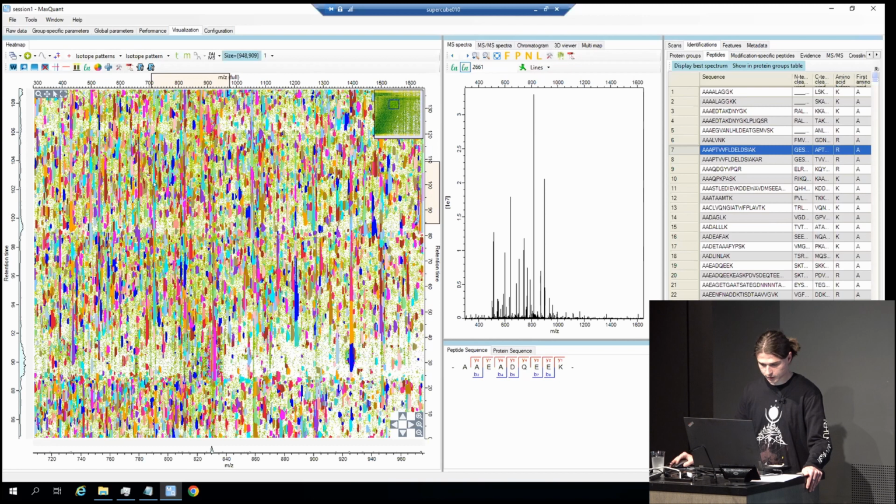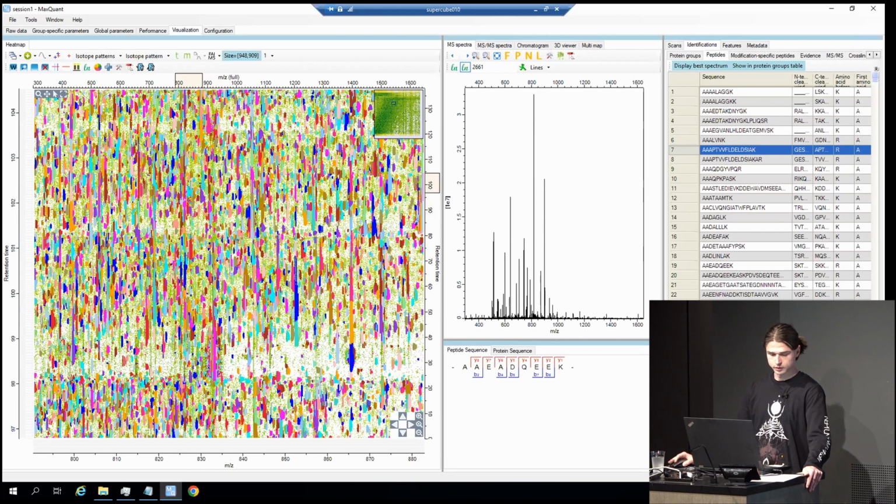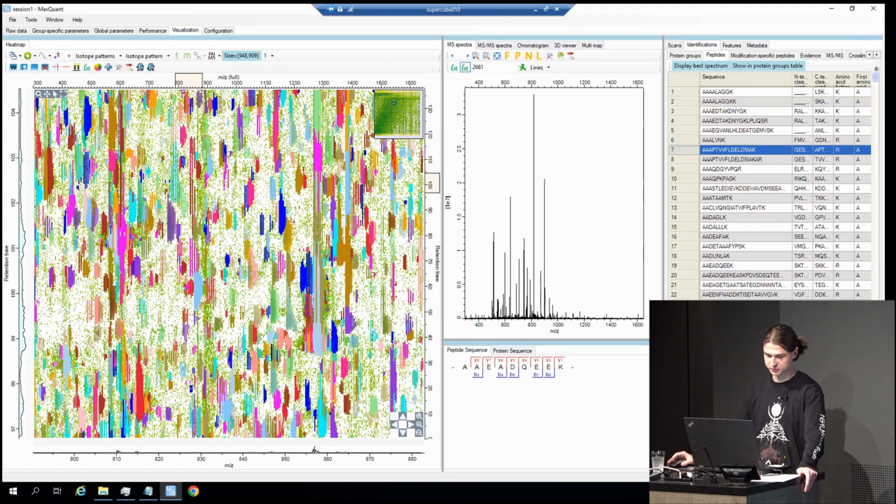Okay, let's go a little bit closer. This takes some time, and it may look like it's frozen, but it's actually not. Please wait until it finishes its job. Don't confuse the viewer with multiple requests. So now we see the isotope patterns closer.